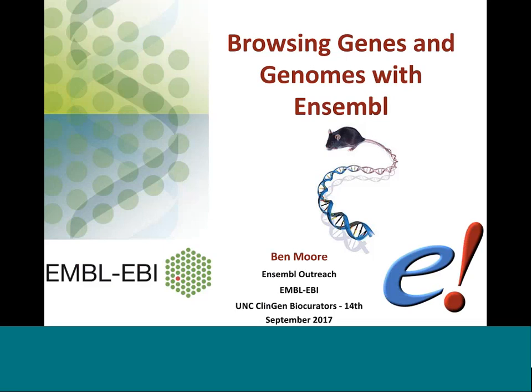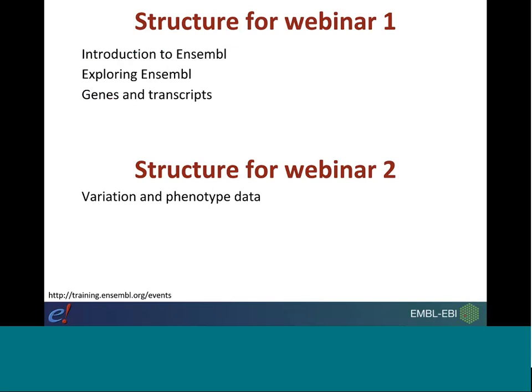So we're going to be looking at the Ensembl Genome browser, the web interface, over the course of the next 2 webinars. So today I'm going to introduce you to Ensembl. Hopefully some of you are already partially familiar with Ensembl, but some of you might not be, so I want to talk to you about how the Ensembl data is organized. And then we're just going to jump straight in and begin exploring Ensembl.